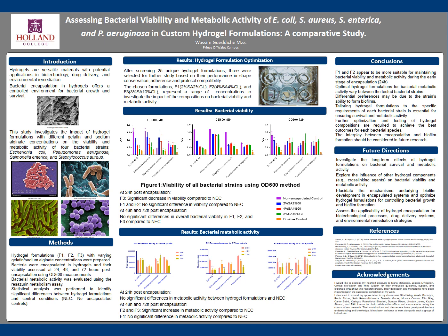The first part of my results focused on bacterial viability using the OD600 method through time. At the 24-hour time point, I observed a significant decrease in viability for the F3 formulation compared to the non-encapsulated controls. In contrast, F1 and F2 showed no significant difference in viability compared to the non-encapsulated controls.